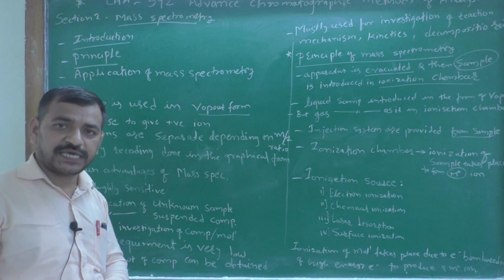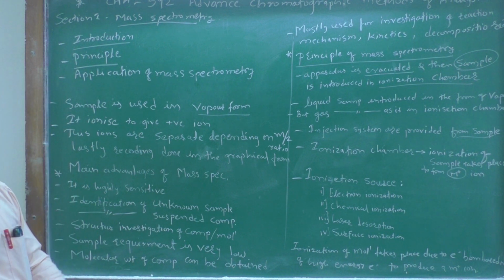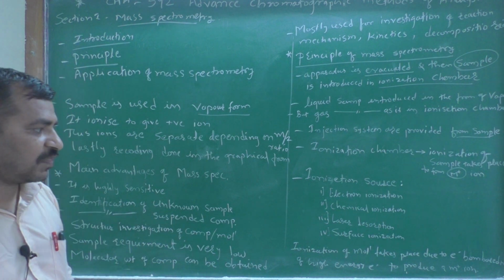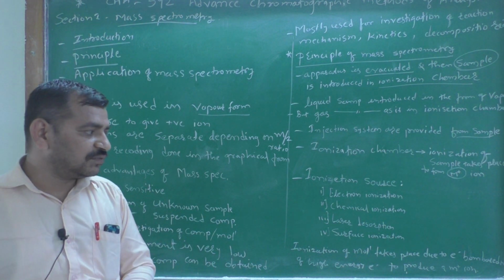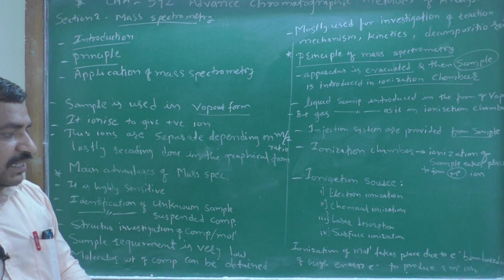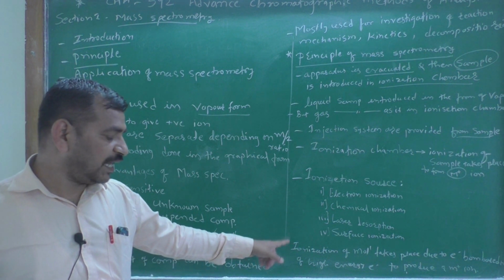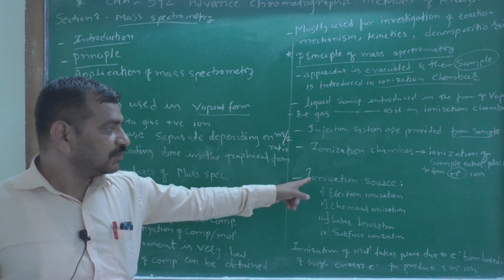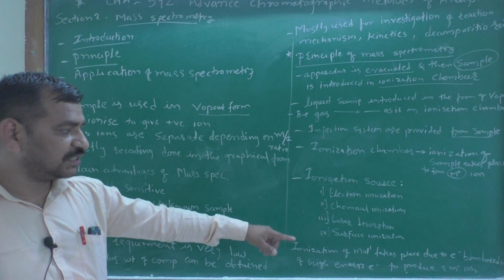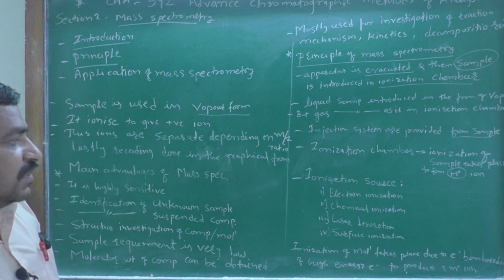Second is chemical ionization. Third is laser desorption. Fourth is surface ionization.